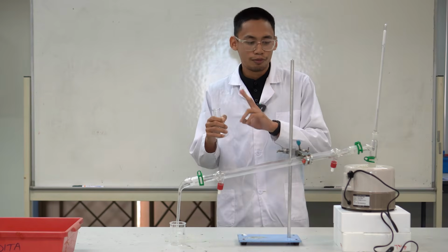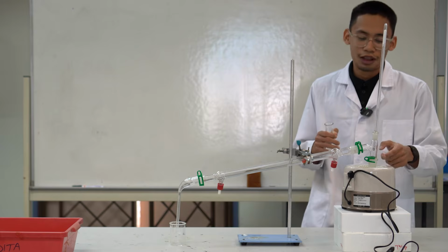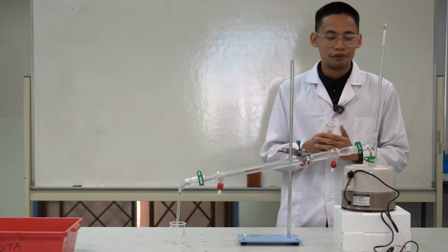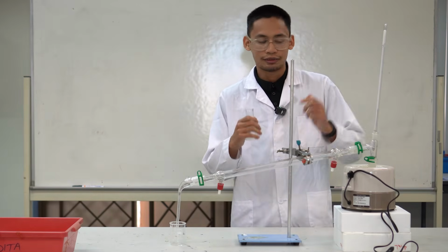After adding both substances, we pour them into the round bottom flask. The round bottom flask serves as a container for the mixture, and normally we fill only about one third, because we want to give enough space for the mixture to vaporize.